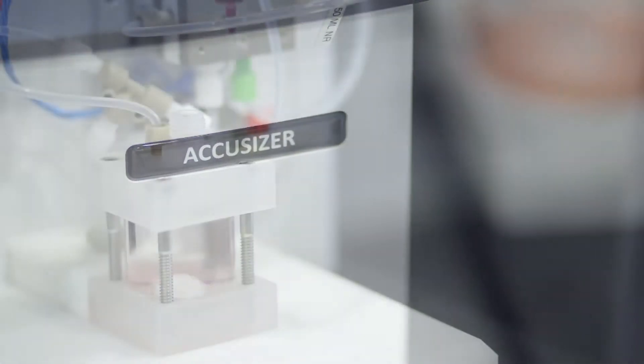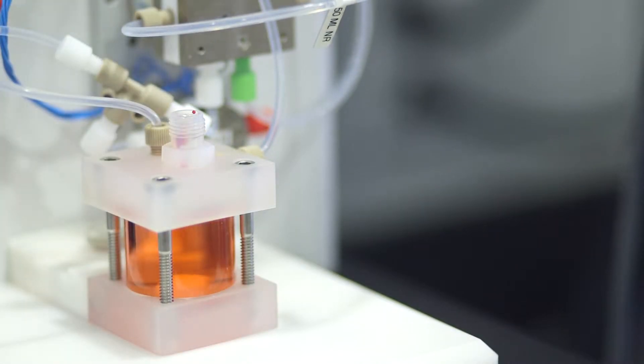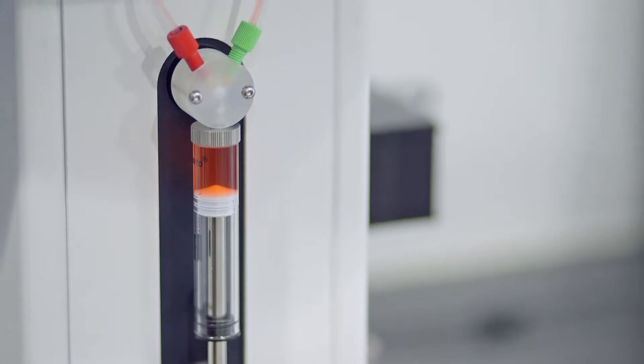Introducing the AccuSizer, both a liquid particle counter and a sophisticated high resolution particle size analyzer from Particle Sizing Systems.